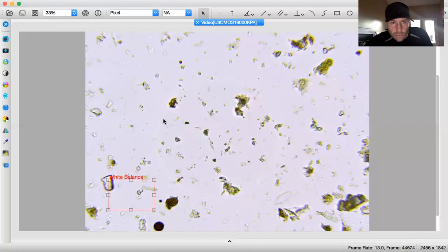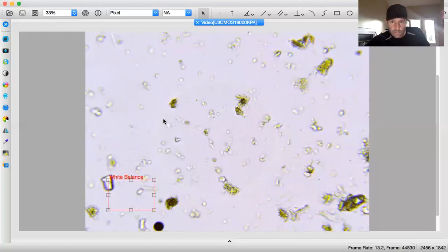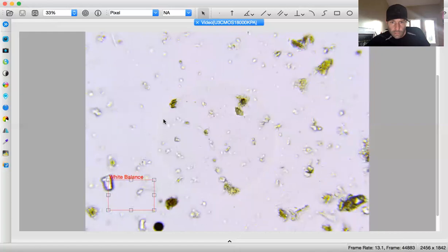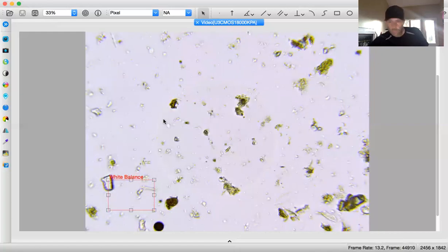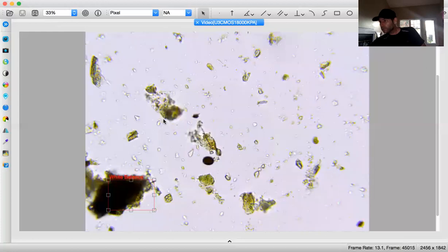A lot of flagellates, though. It's pretty crazy. I'm not seeing anything else to record specifically. On the top of the column and back down slowly. Nothing. Moving on. So that should be 5. And we're going to move down 1 and over now.